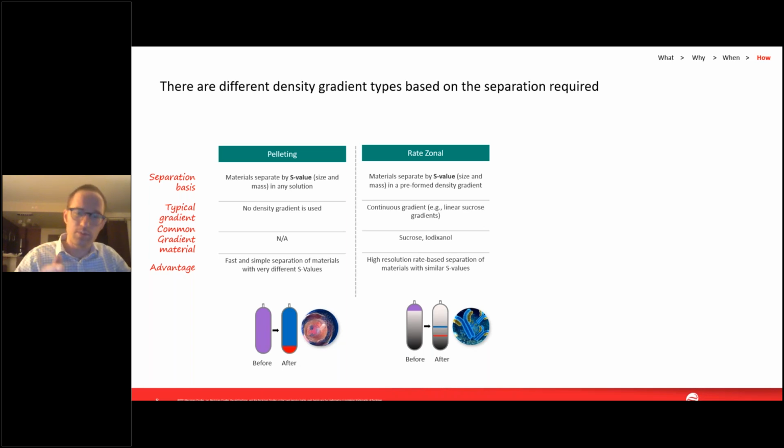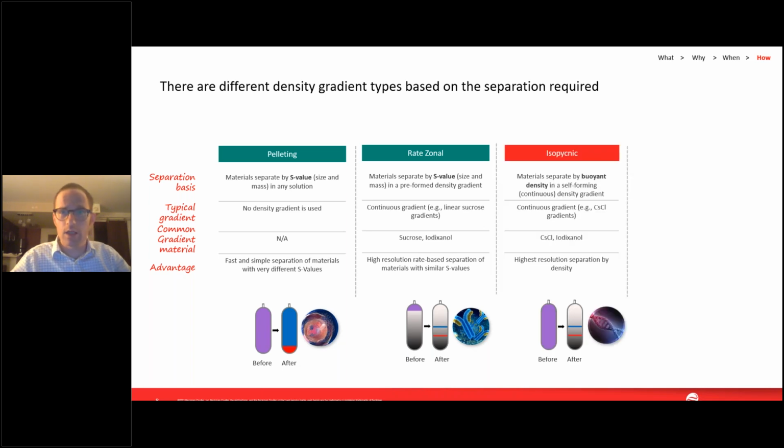And so proteins, right, and protein aggregates where they have differing masses of just even small degrees, that's where you get a very good separation. This is a foot race. Who can get to the bottom of the tube first? But before it pellets, you stop the run, so that's why you have those discrete bands. That's rate zonal. Let's move on to isopycnic.